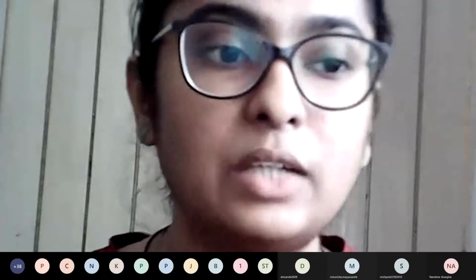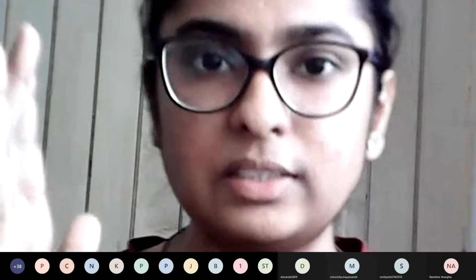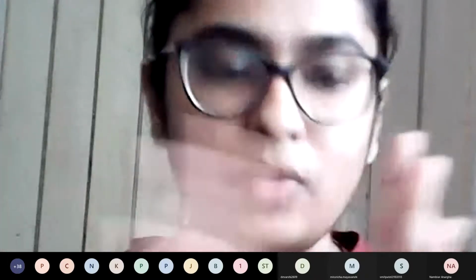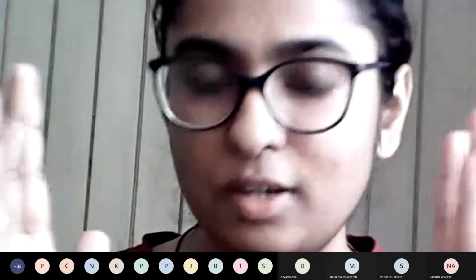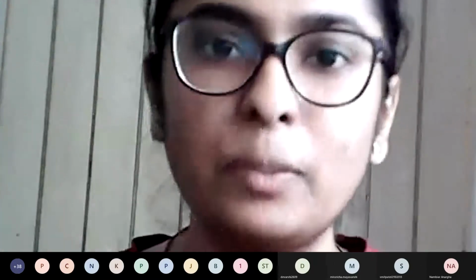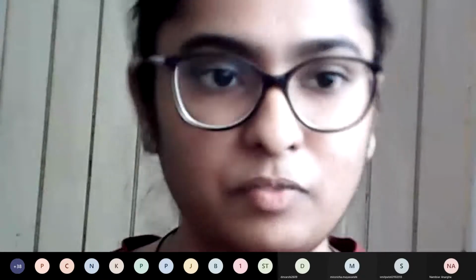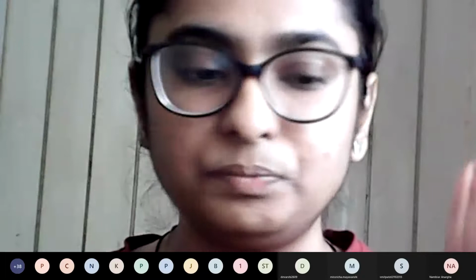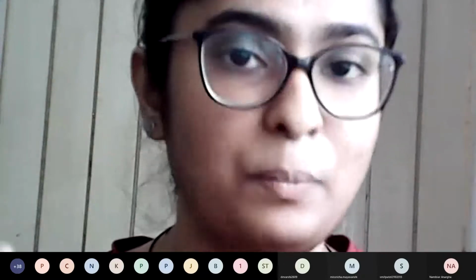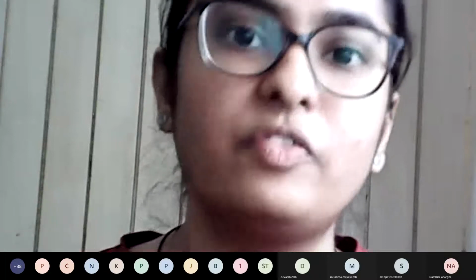So pinkish red is on one side, blue is on the other side. If you are good with colors, you might know that somewhere in the middle of these two colors comes the shade of violet purple. You know that if we mix red and blue, we can get a purple violet color, right? So at one stage, just before the end point, you will find a purple violet kind of shade.